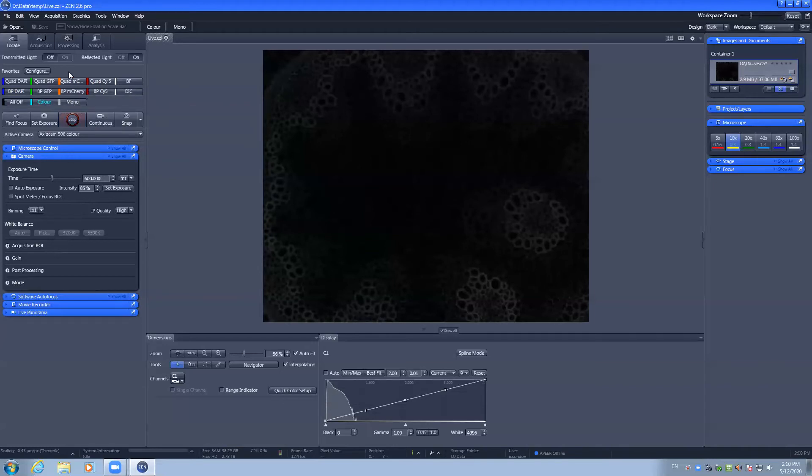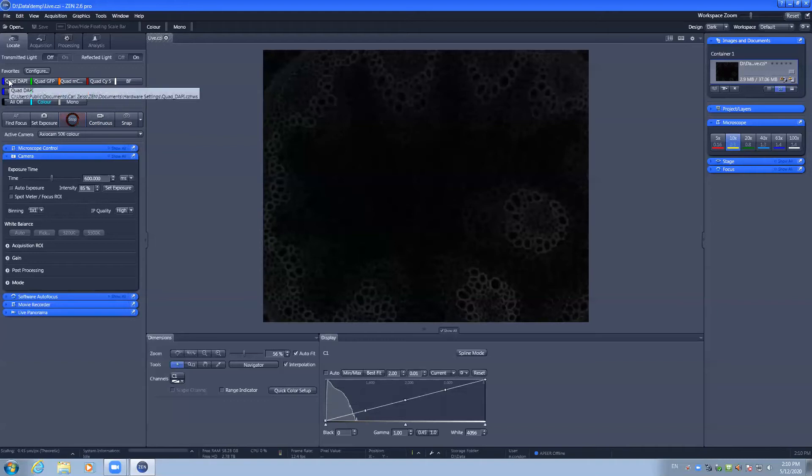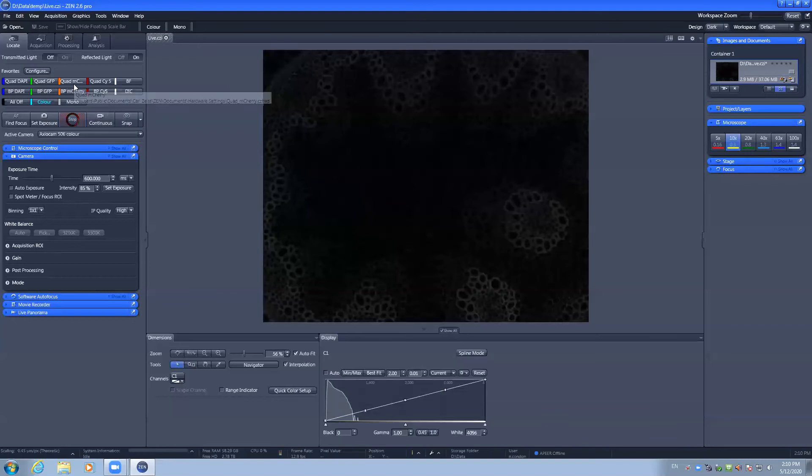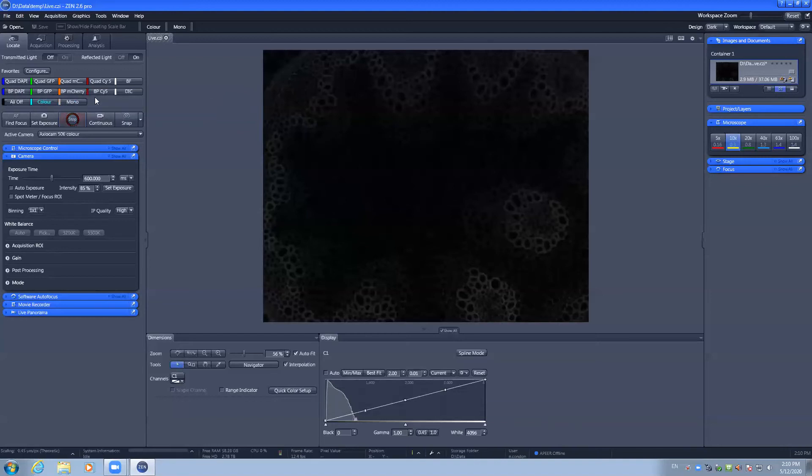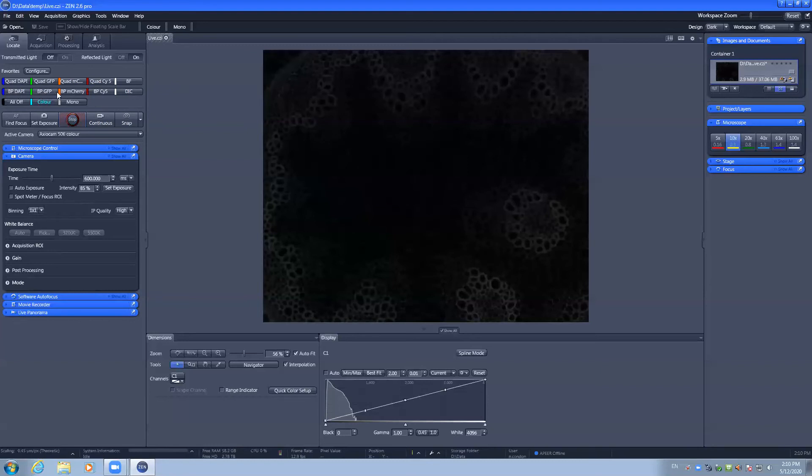The difference between the quad band filter and the single band pass filters is that the quad band is a compromise for speed where it is capable of using the LED light source to capture the DAPI, GFP, mCherry, and Cy5 without moving any physical components, allowing for high speed imaging. Whereas the single band pass filters are individual filter cubes and will be required to be moved between channels of the acquisition. However, at the compromise of speed, you have better signal capturing capability using these filters.